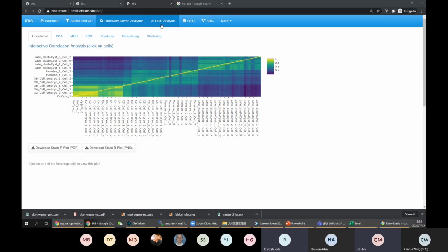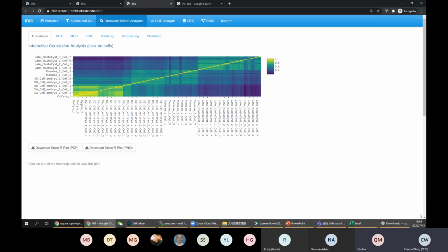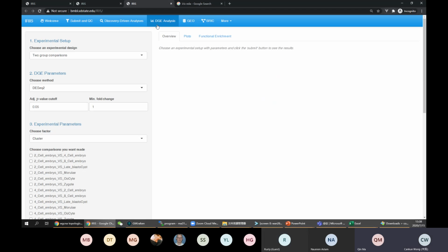Any questions so far? Okay. Tangkun, it seems we are good to move on to DGE analysis.